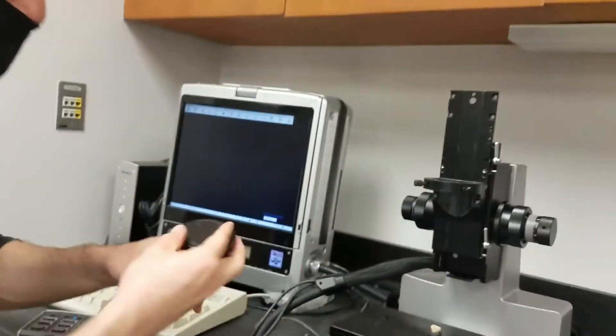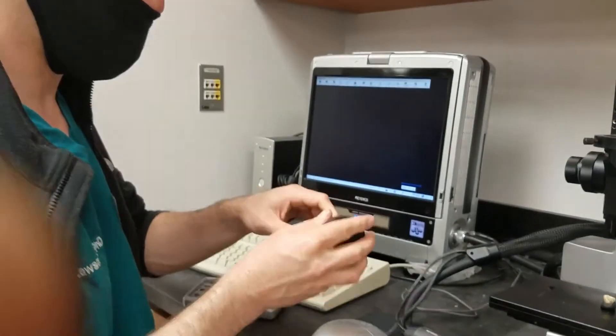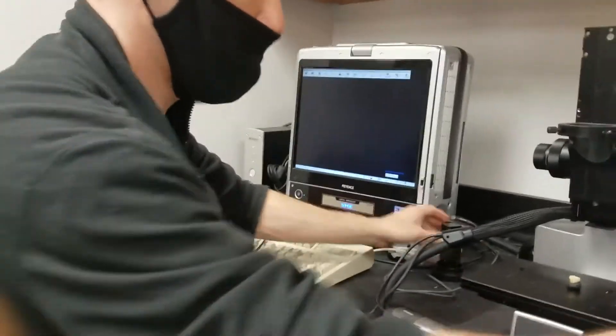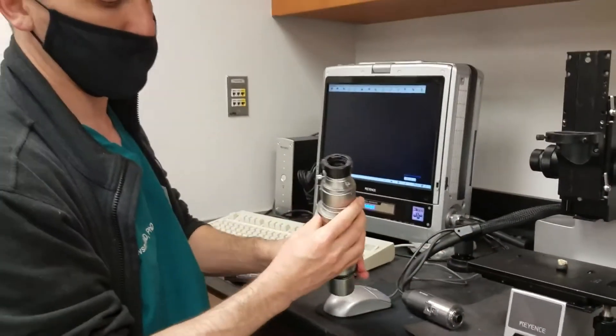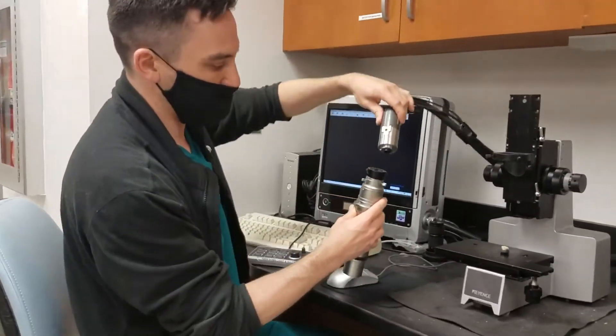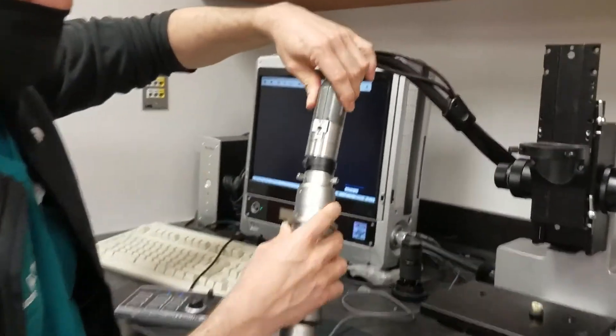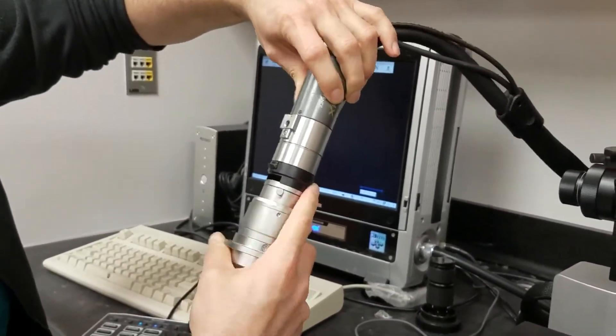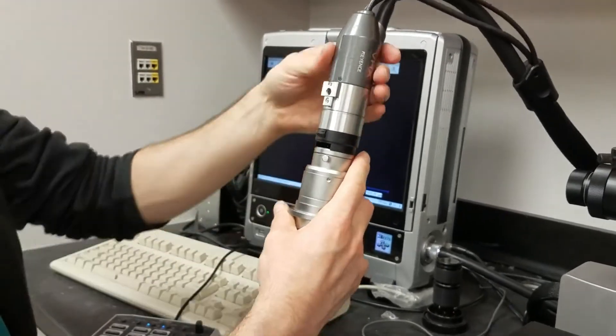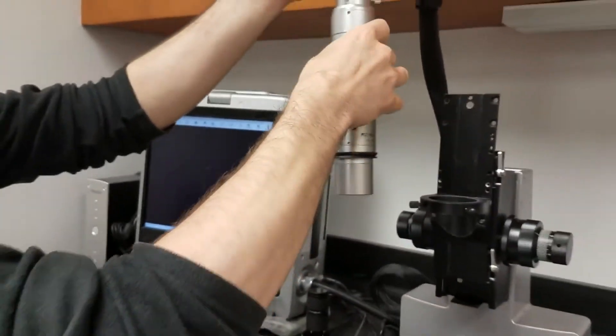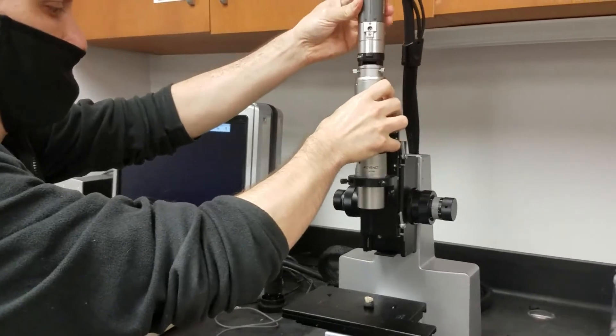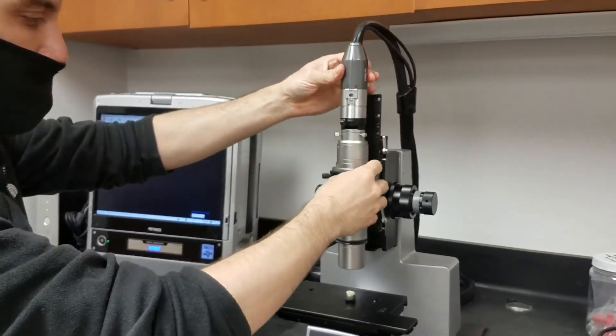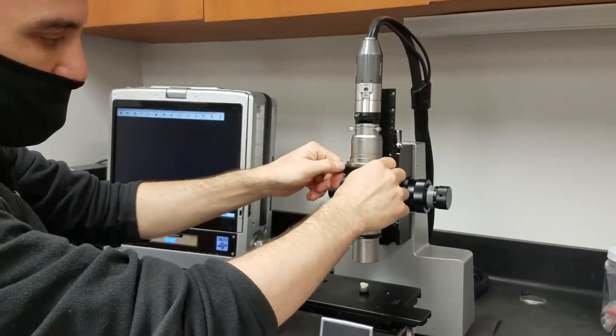And then I can put the new lens on. So I've got to line this up and twist until it clicks. So now we've got the new lens. I can put this on here and now I tighten it.